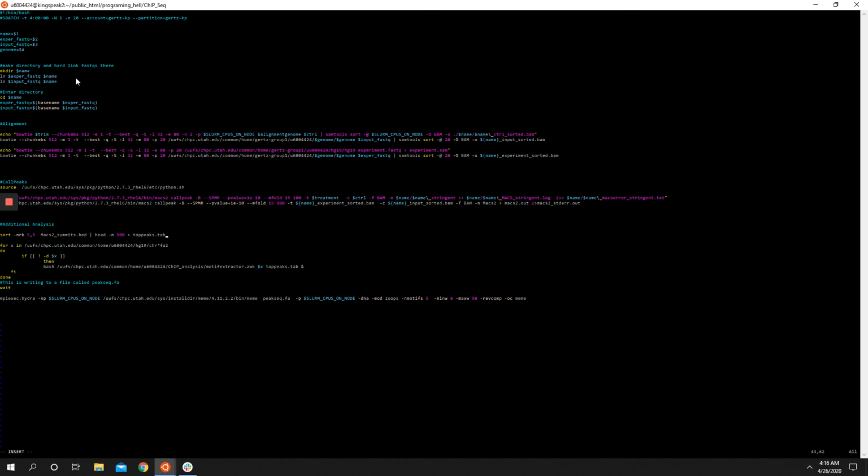Good. What we can do here, again, in this folder, we're not going to use this top peaks file anywhere else, so we'll leave the naming the same. But we do want to add one thing here.